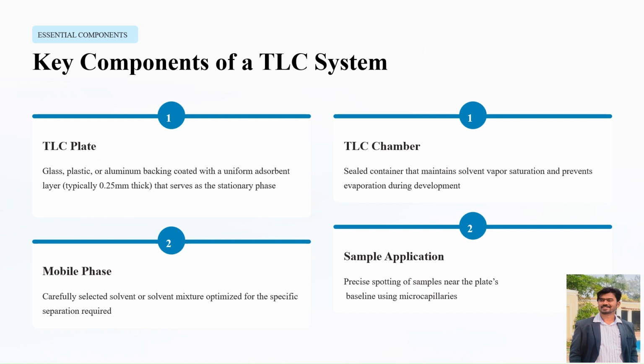Also, you can use a ready-made TLC plate for the TLC procedure. And the mobile phase, TLC chamber, and sample application. For the mobile phase, you can use various types of solvents like water, methanol, ethanol, n-hexane, etc., based on the polarity.